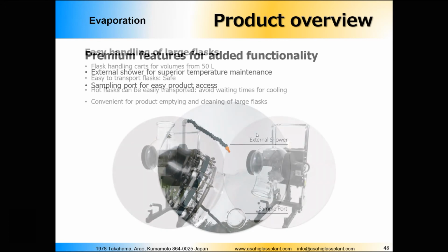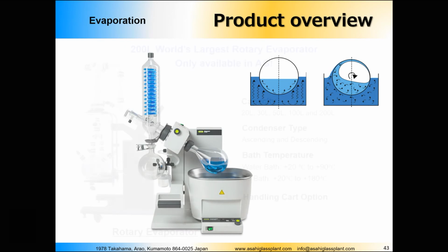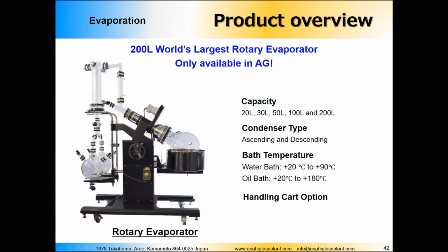When we're talking, let me get back to this slide. When we're talking about the big rotary evaporator, I believe this one is 100 liter or 50 liter.